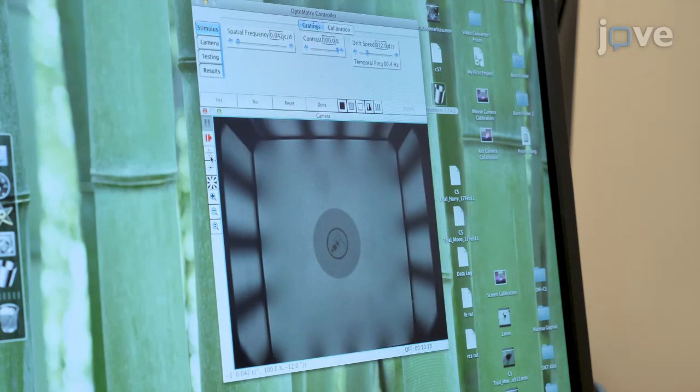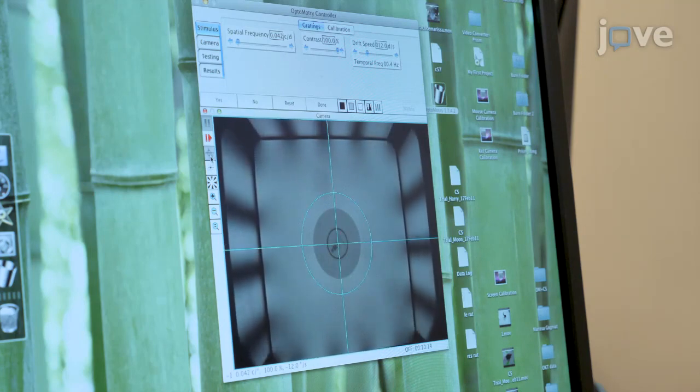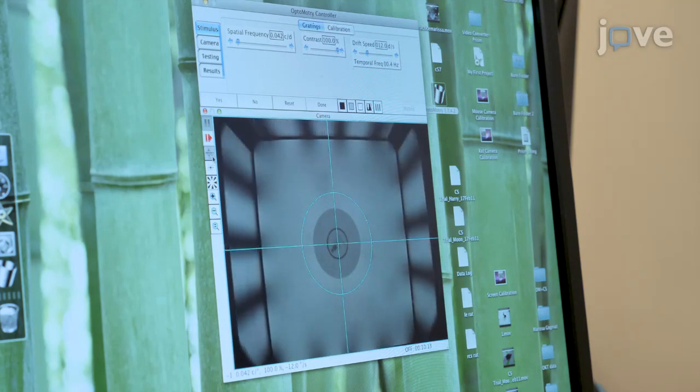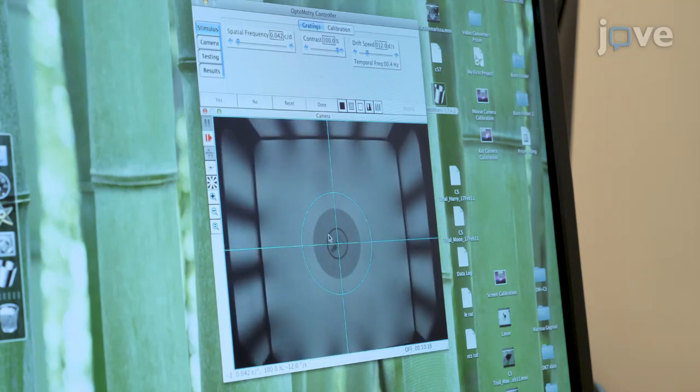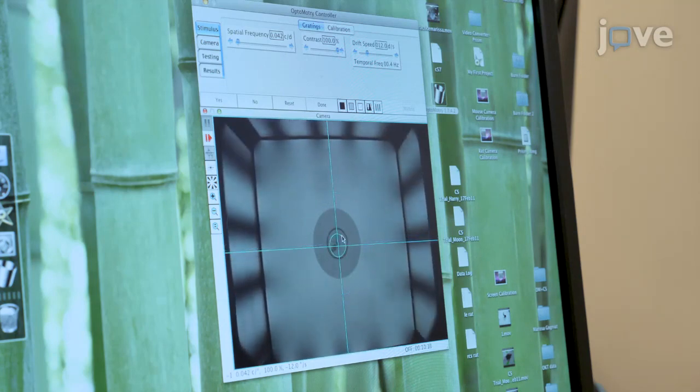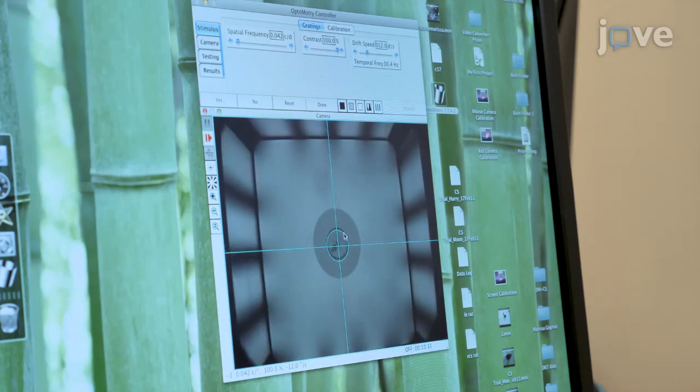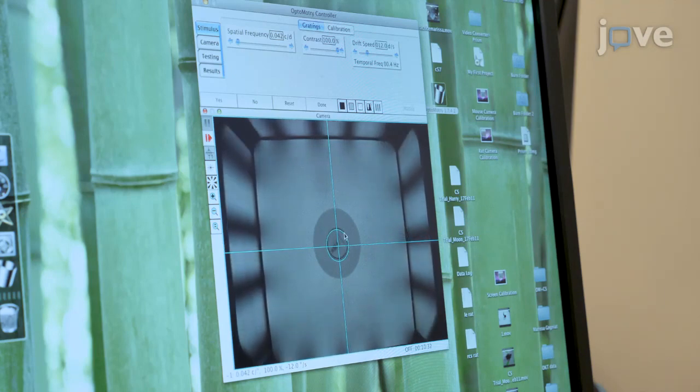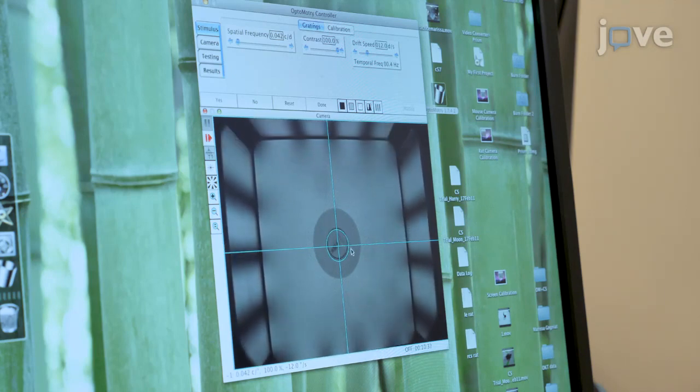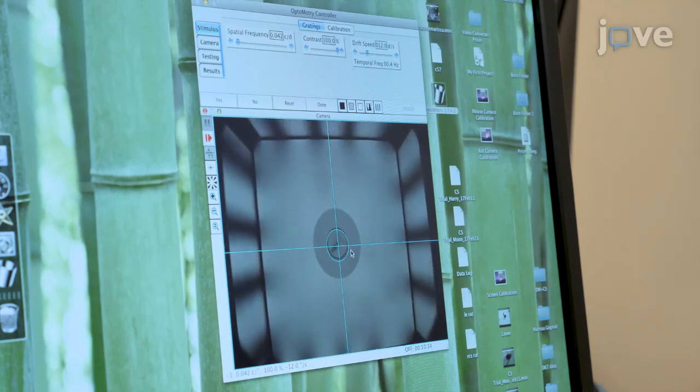Click the compass icon so that a green circle and two perpendicular lines appear, and stretch the green circle so that it aligns perfectly with the black circle on the platform.